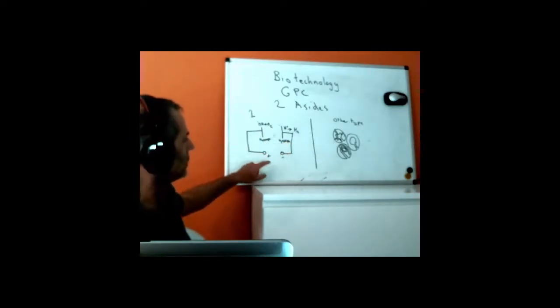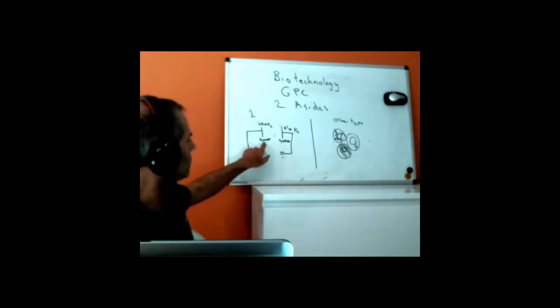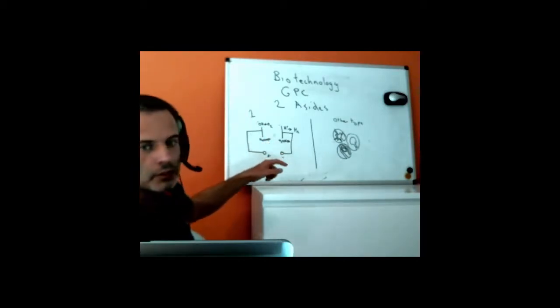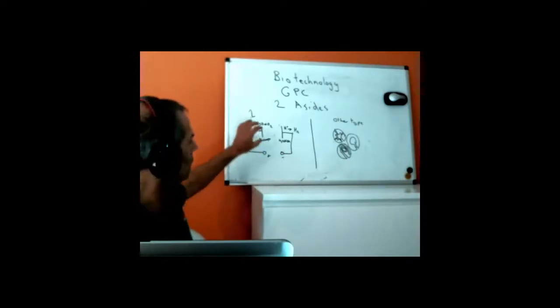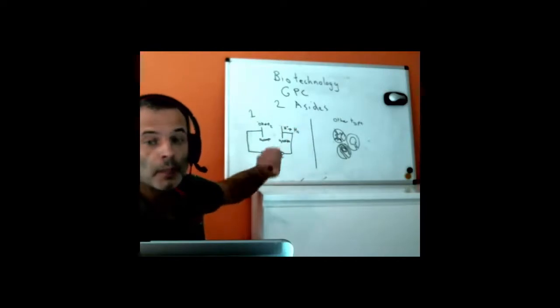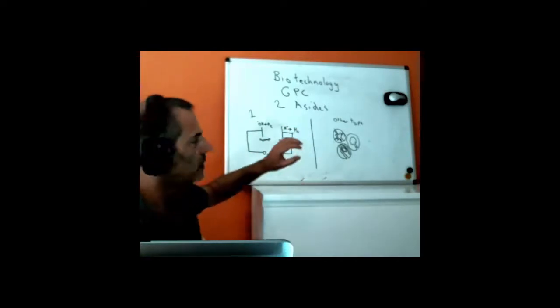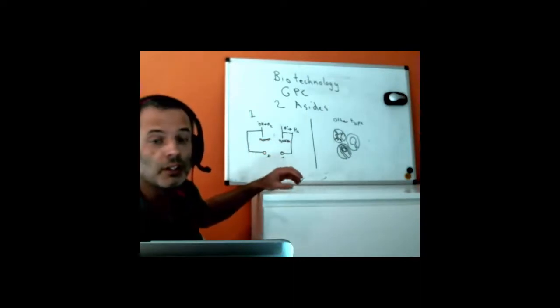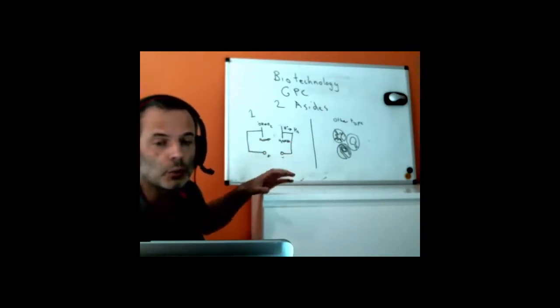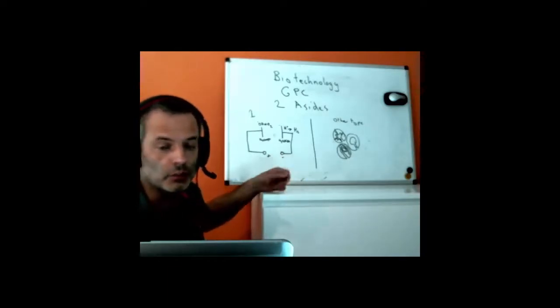And on the other side, the positive electrode, we will make oxygen from OH-, and eventually we'll have to make more OH-, which leaves H+ left over. That will have the effect of making this electrode very acidic and this electrode very basic. And therefore the liquid in there, which I said I was going to mention, has to be a buffer to prevent the pH from changing, because what we don't want to happen is the DNA to change charge while we're doing the process. That would suck.